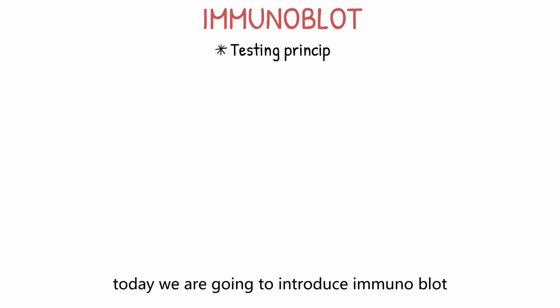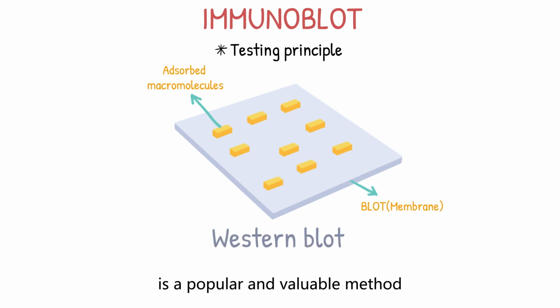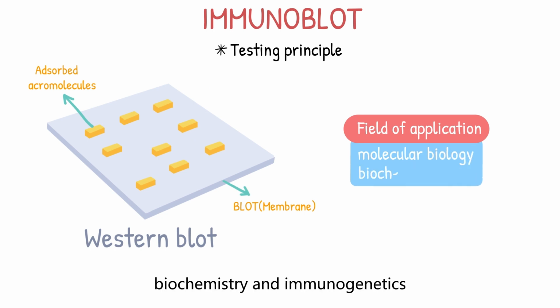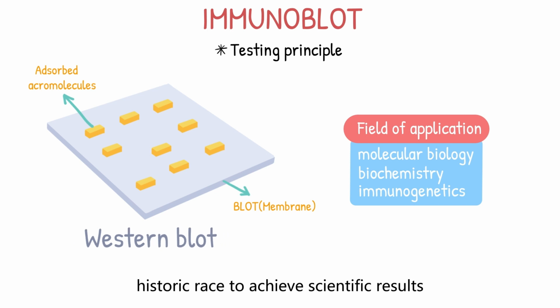Today, we are going to introduce Immunoblot. Immunoblot, often referred to as Western blot, is a popular and valuable method used in the fields of molecular biology, biochemistry, and immunogenetics. The name Western blot comes from its original historic race to achieve scientific results.